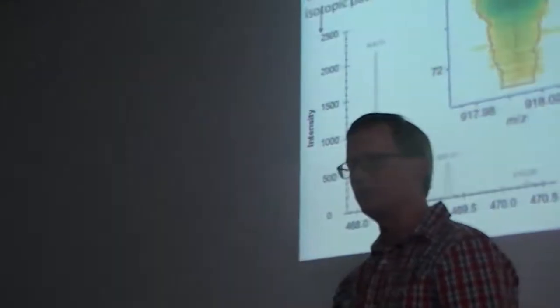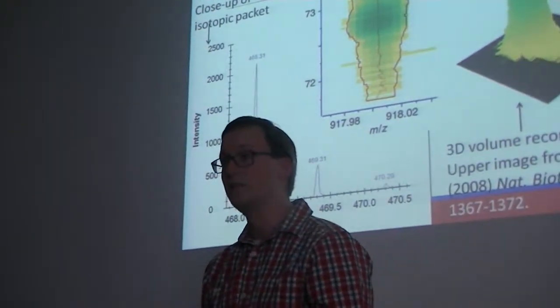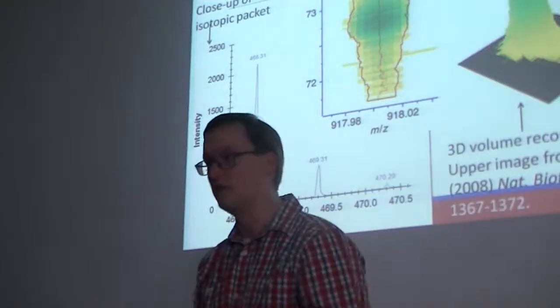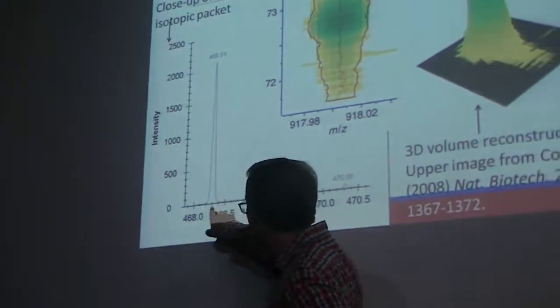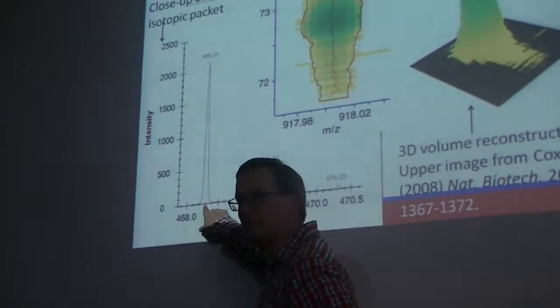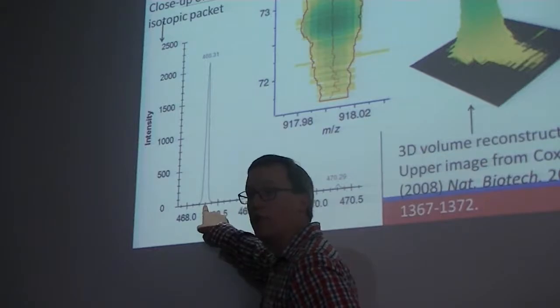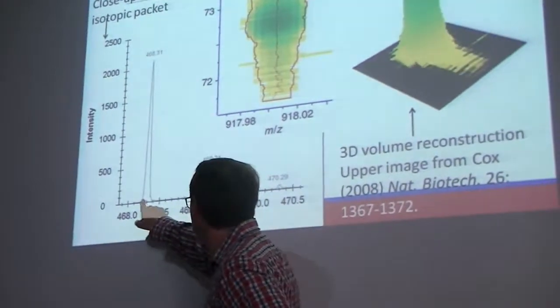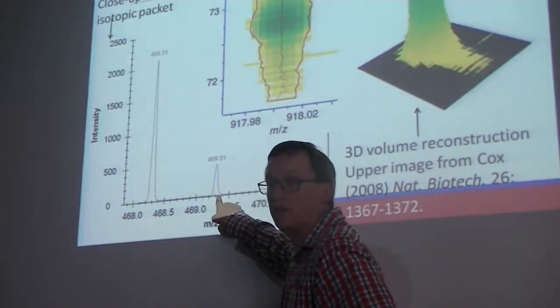They're isotopes. Ah, on the nose, yes. Isotopes. So, about 1 in 100 carbon nuclei is heavy. Is a C13 instead of a 12 Dalton unit. So what we're looking at is the ions of this peptide that are all C12, the monoisotope, in other words. And these are the ones that have 1, perhaps carbon 13 in them.